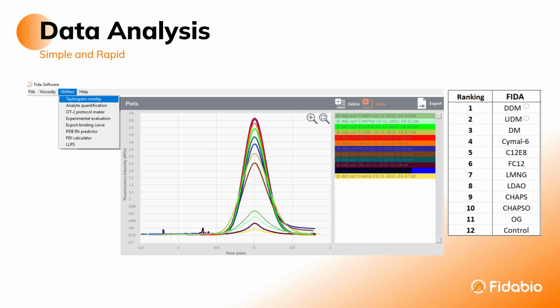The ranking of this assay was led by DDM and UDM, which solubilize almost the same amount of protein, followed by DM, Cymal6, and so on.